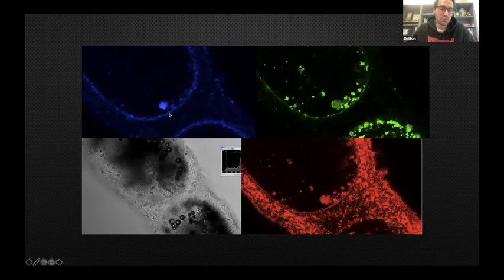And this is a confocal image, about halfway through a cell. So this is actually showing what's on the inside. And we can see that Thiomargarita's membrane is being labeled here. This is the sheath area surrounding it. And then this is another cell here. Here's a transmitted image, and we're focusing on this vesicle, which has endobionts in it.